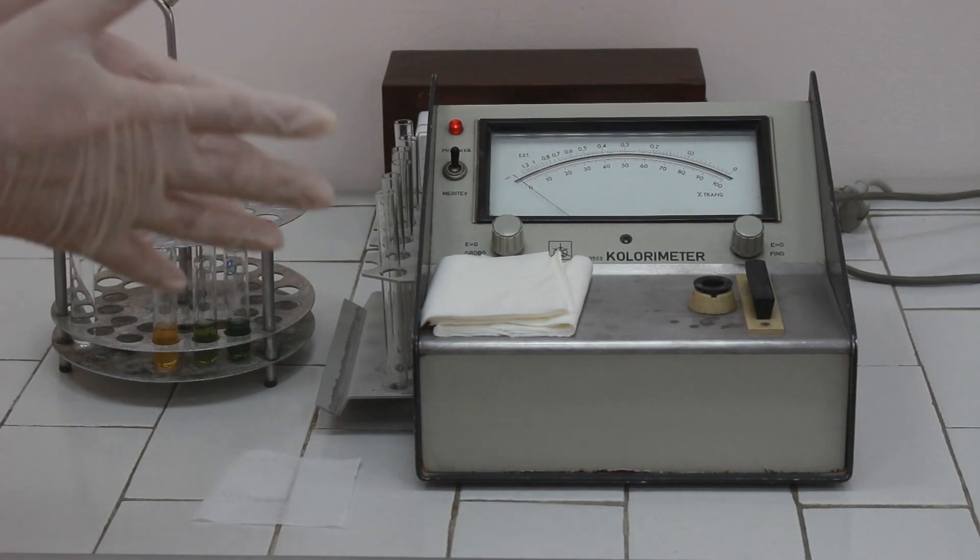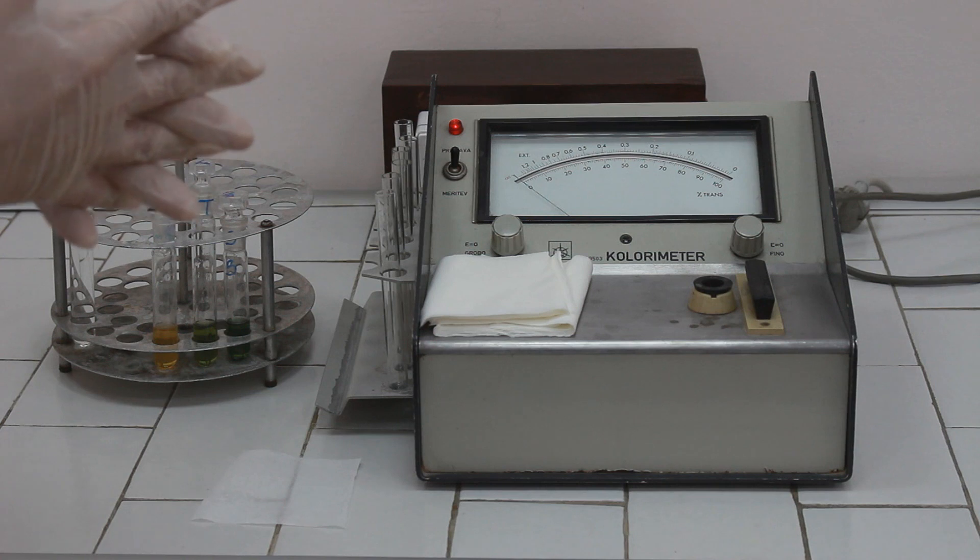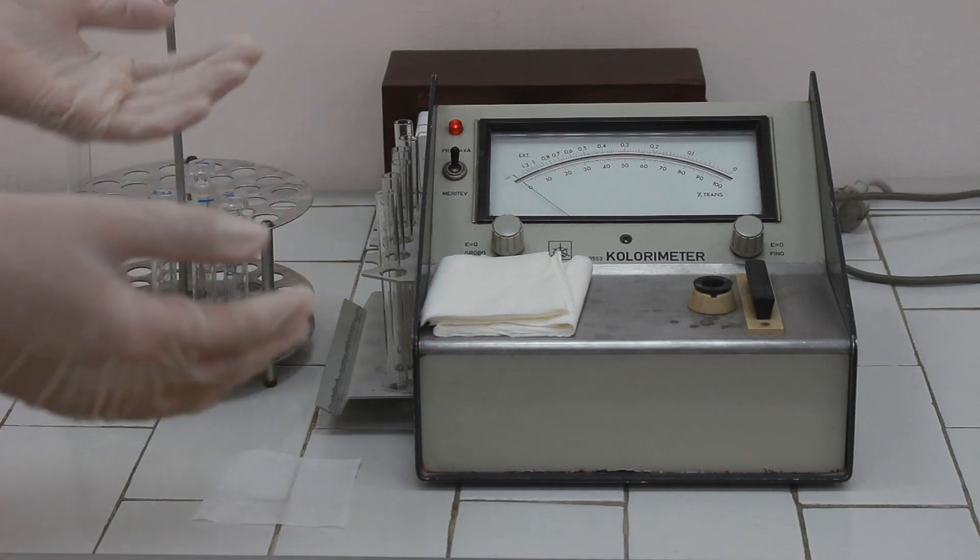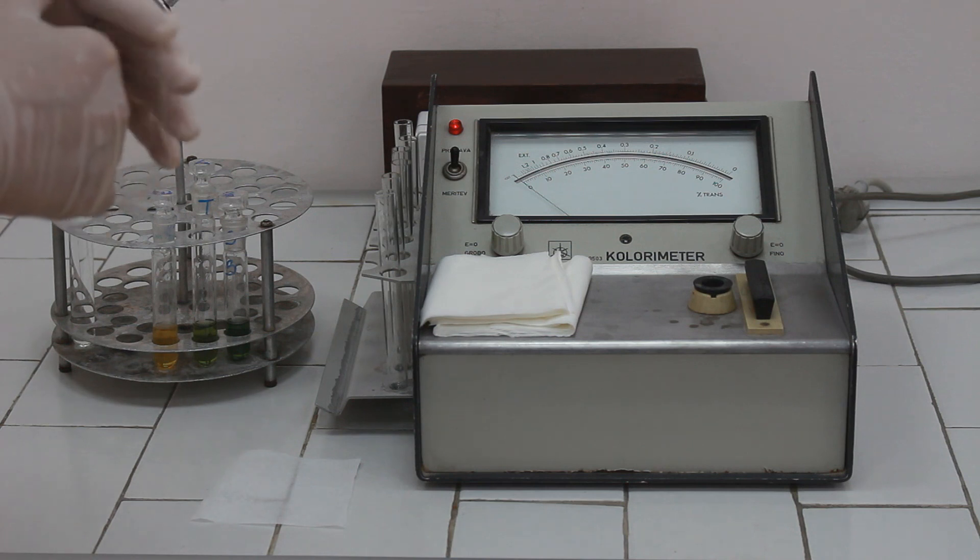So whenever we are dealing with aggressive solutions such as strong acids, the measurement of absorbances should be done by using this colorimeter. The principle of the functioning of this instrument is pretty similar to the normal photometer. But instead of the digital scale, we have the analog scale with a needle. And with this instrument, we are not able to adjust the specific wavelength of measurement. We just need to use the filter. Whenever we have green colored solutions, we have to use the red filter.